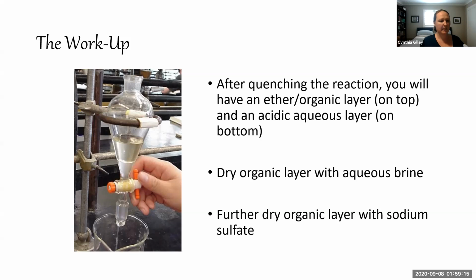in the process. Once we have drained all three of those aqueous layers, so again, the first aqueous was the aqueous acid that we added during the quench. Next, optionally, some people will add aqueous sodium bicarbonate. We can drain that. Again, that will remove any trace acid from the organic layer. Then the aqueous brine. Again, all of those aqueous layers will be the bottom layer, so it's very easily drained from the separatory funnel without having to remove the ether organic layer from the separatory funnel at any time. So lastly, we'll be left with just the organic layer in the separatory funnel.